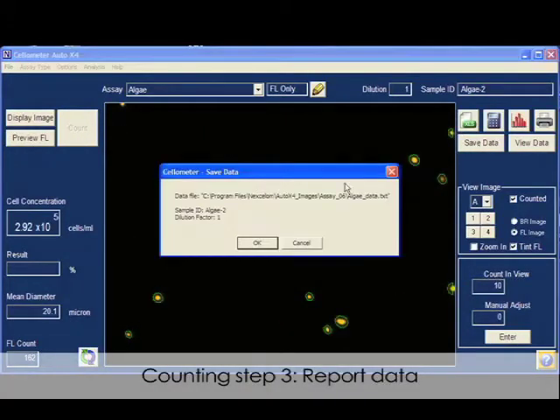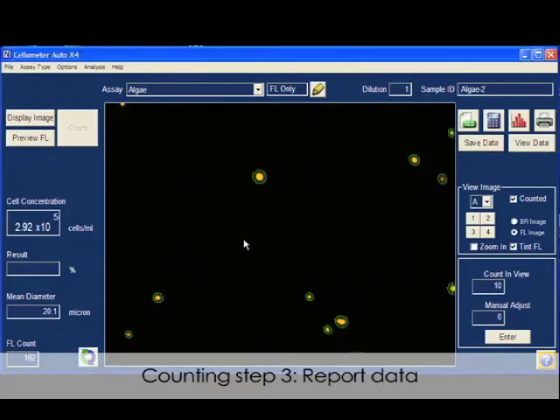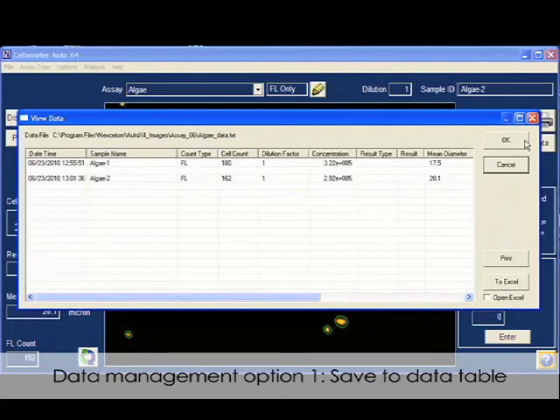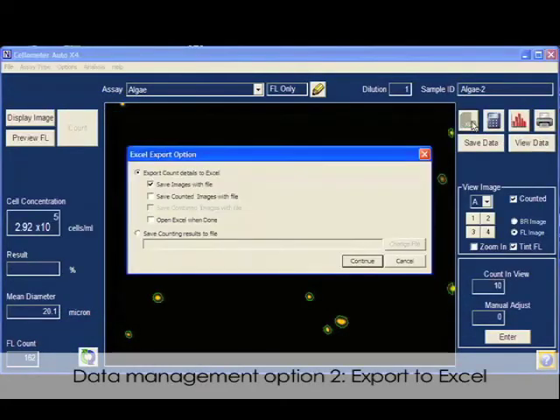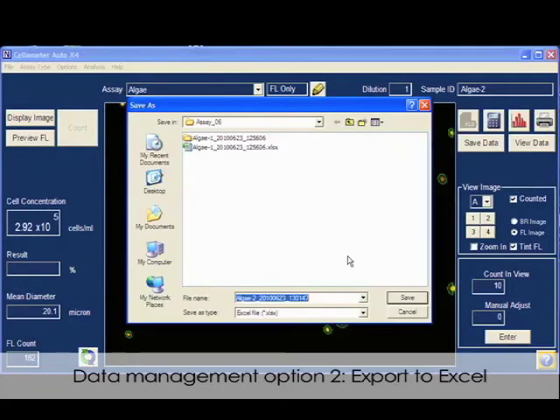Algae cell concentration and cell size histogram are automatically reported. Counting data is saved in a table for multiple samples. Export to Excel saves the information of each cell counted.